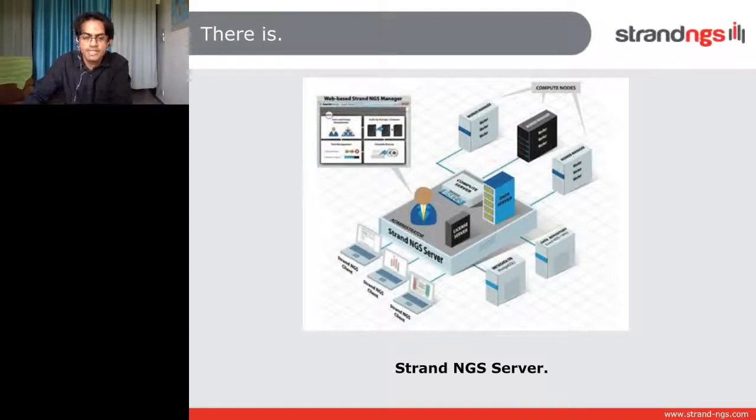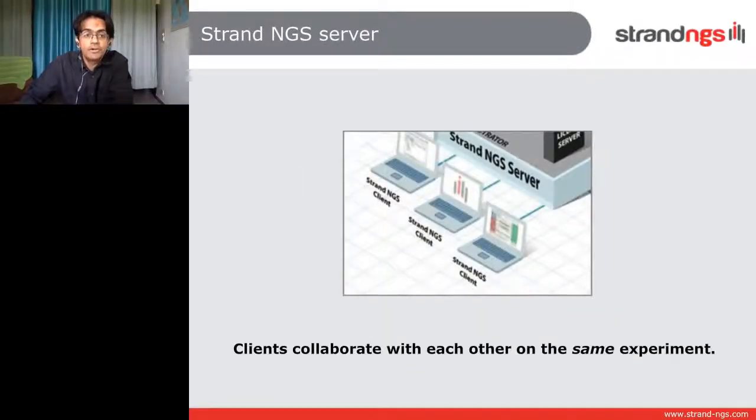So the first thing that it enables is what we asked for, which is that it's a server client setup. So clients actually collaborate with each other on the same experiment, right? It could be just a particular individual with a particular disease that you are trying to analyze and interpret, and that corresponds to one experiment.